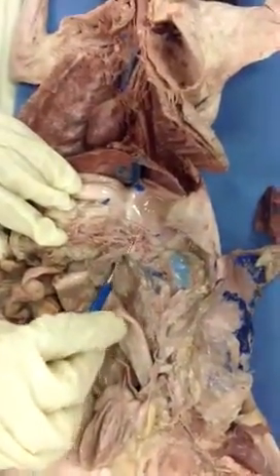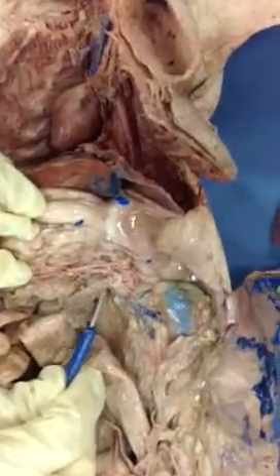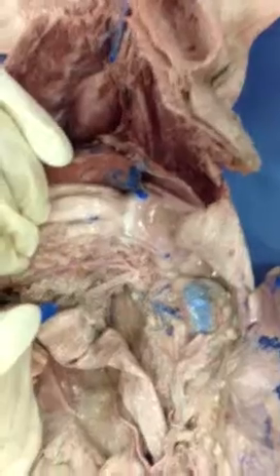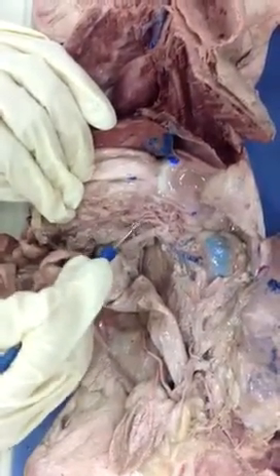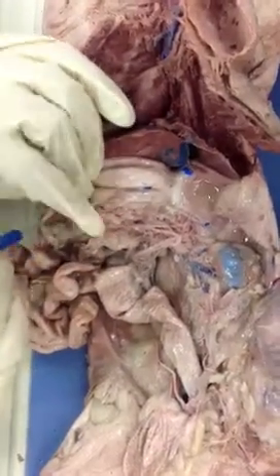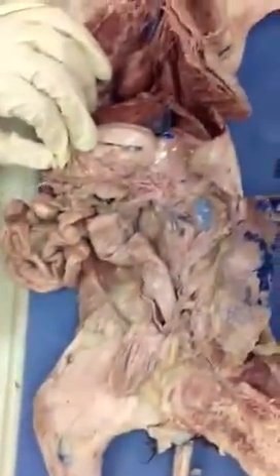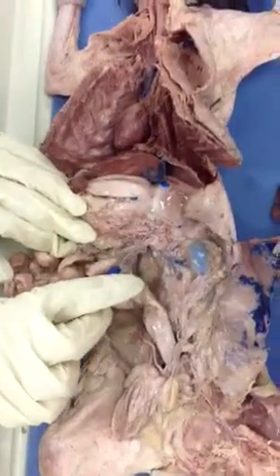So I notice that this is going to be my first branch. Do we see it? This is the celiac trunk, right? Now that celiac trunk gives me branches, right? The first branch we call it the hepatic. Then we follow it, and then it gives me the gastric, and then the splenic. We could literally follow it how it's going towards the spleen. You see it? Very good. Now this is my celiac, right?